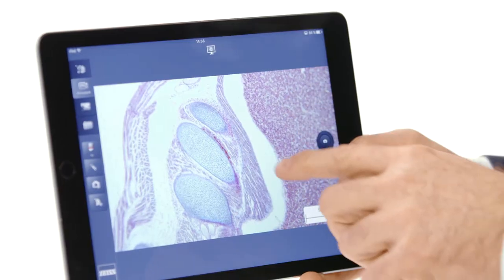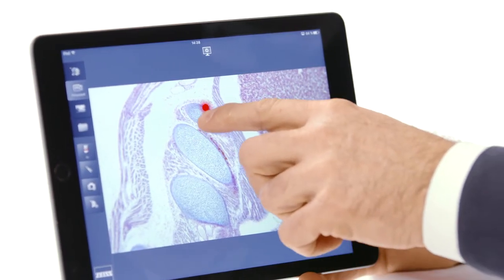A red mark will appear any time you point out structural details with the tip of your finger.